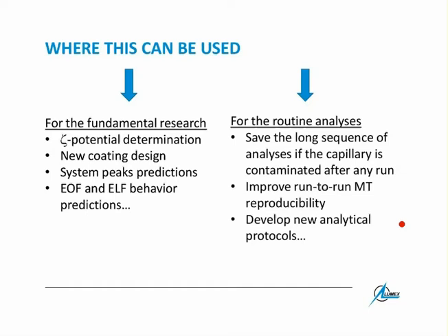And then you start the sequence of the runs, and you go back home. And when you come back in the morning, you expect that you get all the 20 analyses done in a perfect way. But imagine what happens if your sample number 5 is contaminated more than all other samples.